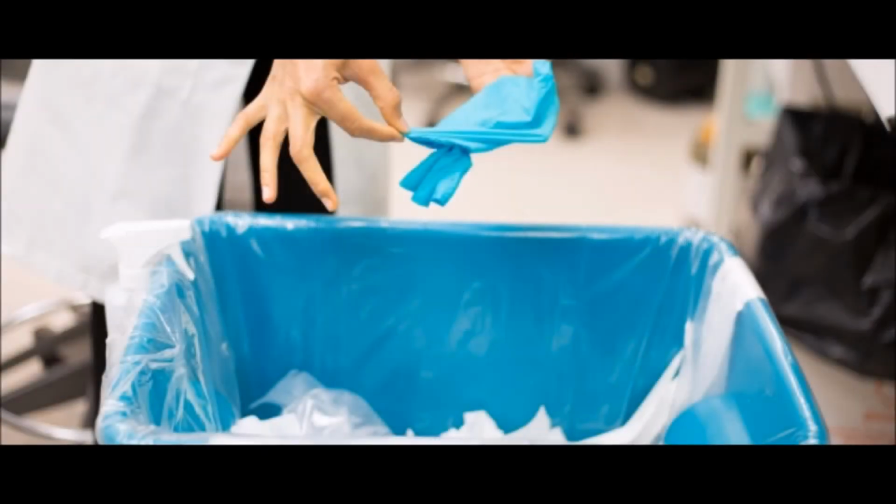Since we were dealing with E. coli, we had some extra safety precautions to follow. Gloves, goggles, and lab coats were worn at all times during the lab. All gloves had to be disposed of in a separate trash bag. We cleaned our gloves and the countertops regularly with 70% ethanol, and all samples of E. coli had to be disposed of in a separate bottle of ethanol waste.